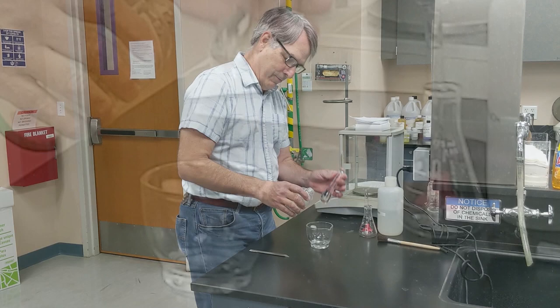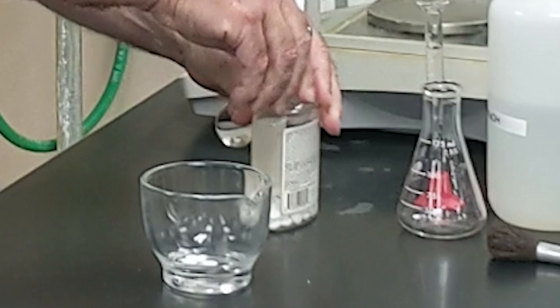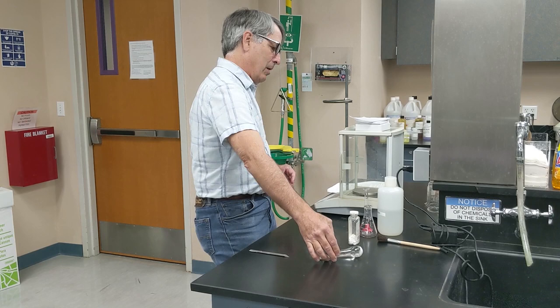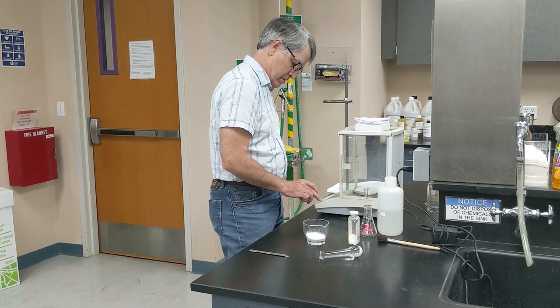So the first step in preparing our sample is we're going to take a couple of tablets of aspirin, put them into this mortar and pestle, and get three in there. And I'm going to grind this up to a fine powder. I'm going to weigh a small amount for analysis. So I'm going to use a piece of weighing paper and I'm going to tare the balance now. And let me check to see how much we're supposed to use.